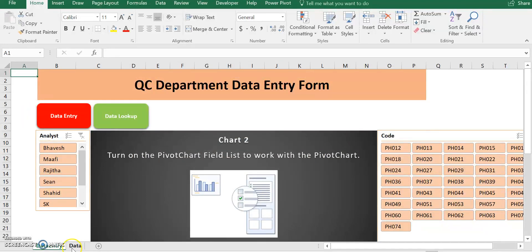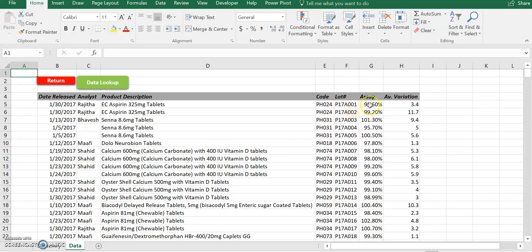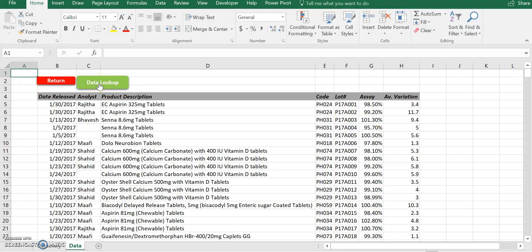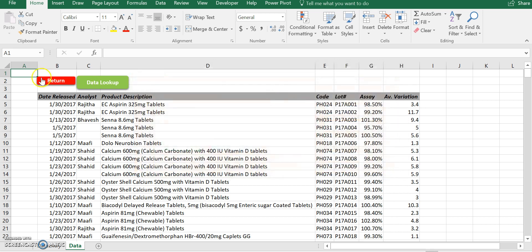So let's just go to our database and check. Yes, Regida, P17A001, 98.5, 3.4 variation, everything is correct. I also put the data lookup, which is the data search function over here. It's the same form you can click. So if you prefer to do it here, you can do so.